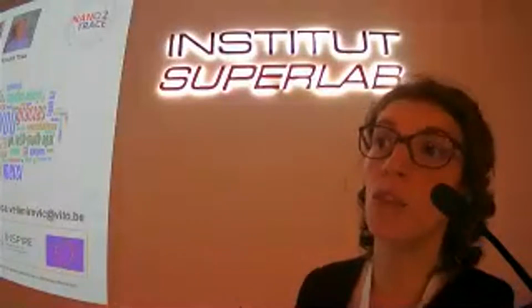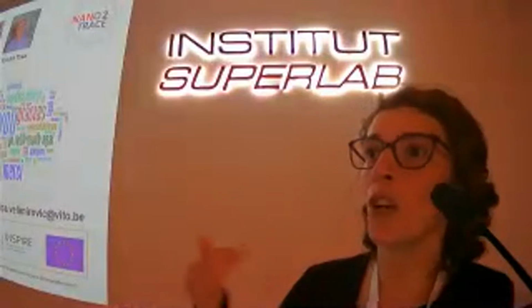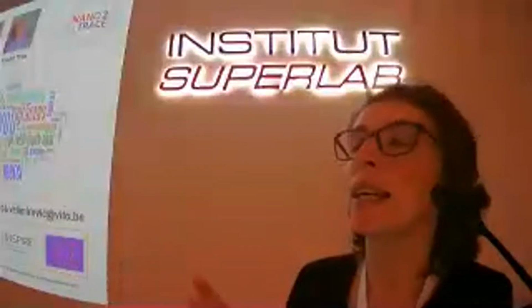But as soon as we put it on the pyrolysis GC-MS, which is more sensitive, you already see after a few days that changes in oxidation occurred. So of course, if you want to build up your FTIR database, you have to weather the samples more often and longer. But indeed, there is quite a lot of literature.